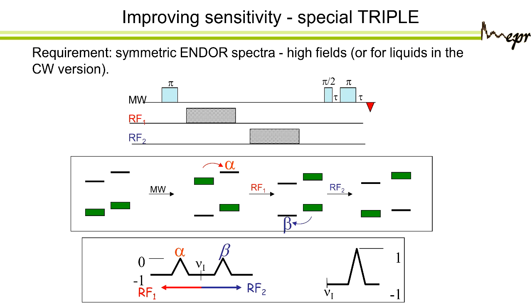So I usually like to see the two lines, because if signal to noise is not so good, if I see it on the other side, I'm happy. Some people take the spectrum and, to improve the line, they mirror and add them. I don't like this. Although it looks very nice, whenever you add another pulse, there's some T1 taking place there, so you may gain on something and lose on something else. So it's not always working, but you can play these tricks, and here is just a nice example.